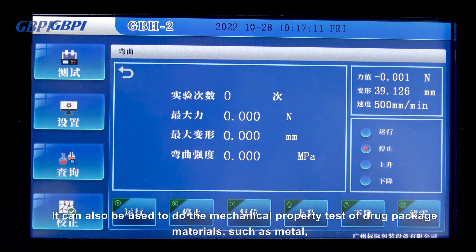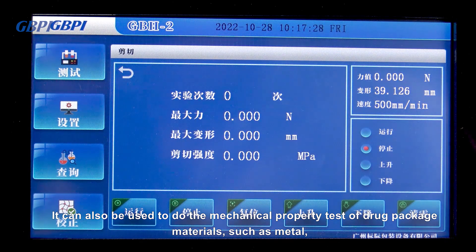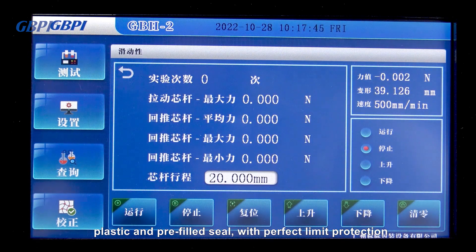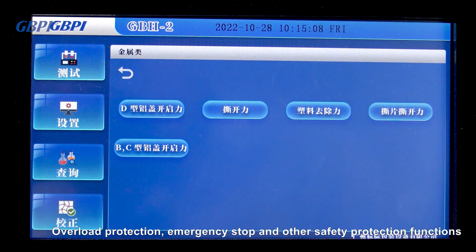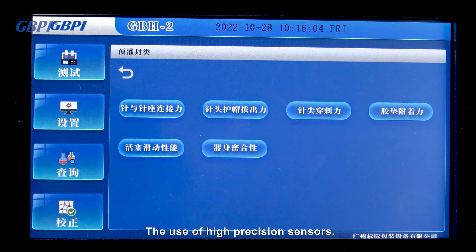It can also be used to test the mechanical properties of drug packaging materials such as metal, plastic, and pre-filling and sealing, with perfect limit protection, overload protection, emergency stop and other safety protection functions.